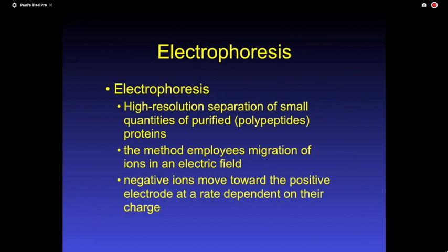But I'm going to use a technique of electrophoresis to actually work on a mixture of proteins that have all sorts of different charges, and we're going to separate in a different way than maybe you've seen it described before. But we're going to use electric fields to move, and we're going to use the matrix to separate. Now there's a difference. Okay? Movement doesn't cause separation. It is the interaction with the matrix.